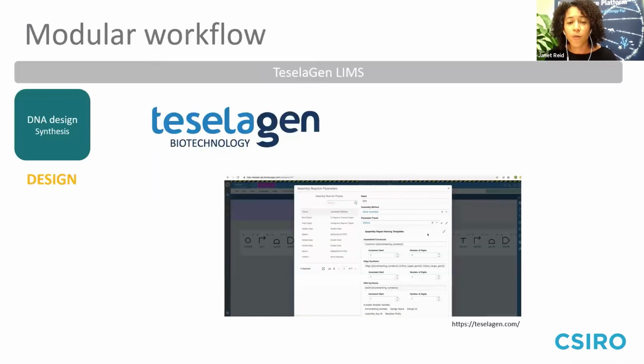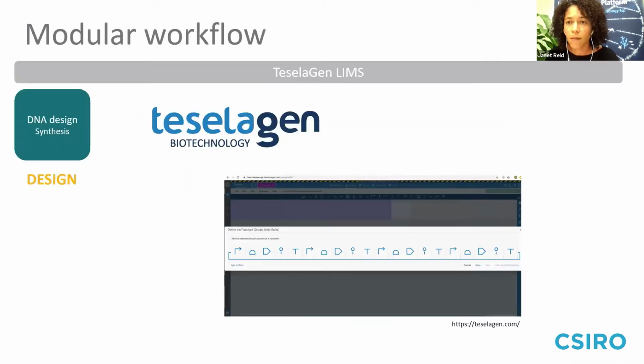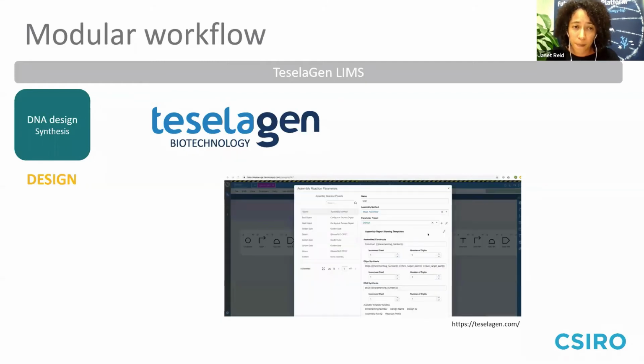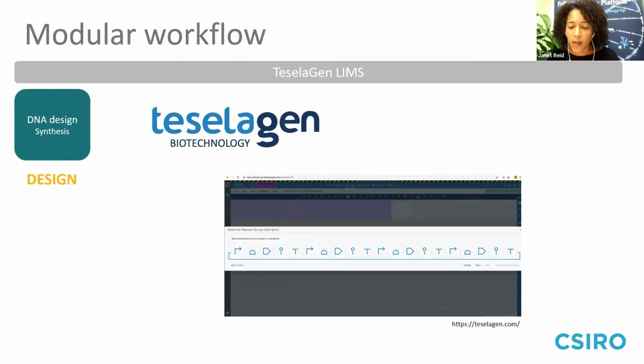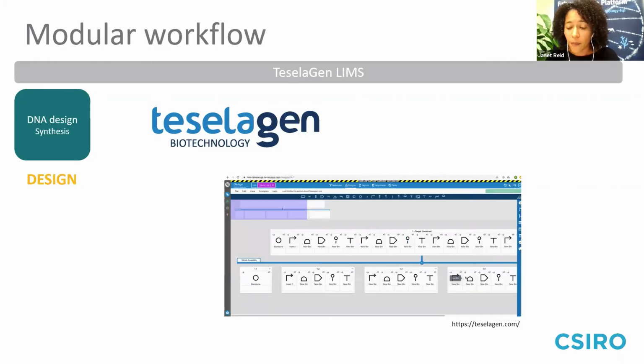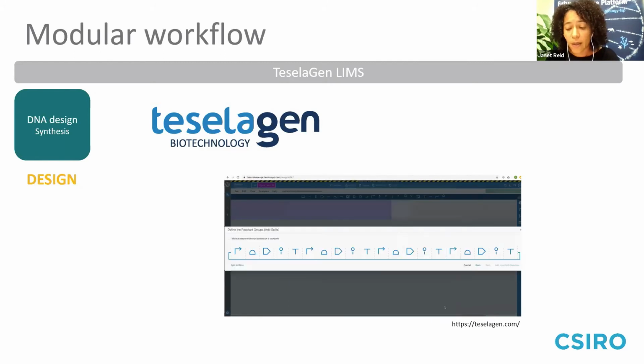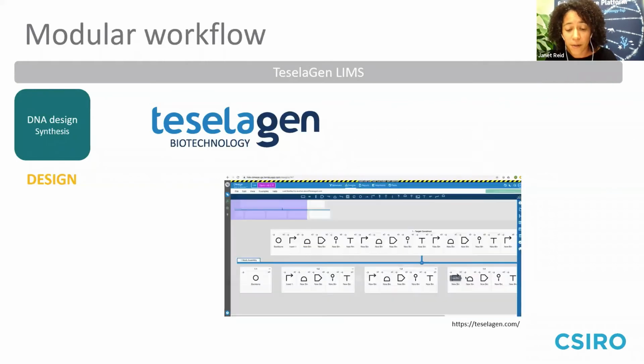I'll give you a breakdown on some of the software and instruments that we use. DNA design and synthesis is the first stage of the process, and the backbone for the Foundry is the Teselagen software. We use the design software as well as build modules, in which we can perform routine cloning through to advanced scale combinatorial and hierarchical designs. The output of this module is a list of DNA parts and primers required for the design. Depending on the design strategy, these lists can be forwarded to your favorite synthesis company or PCR generated.